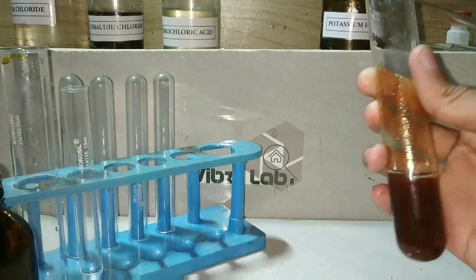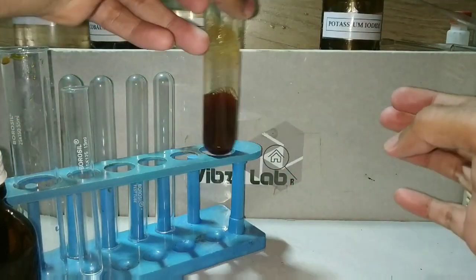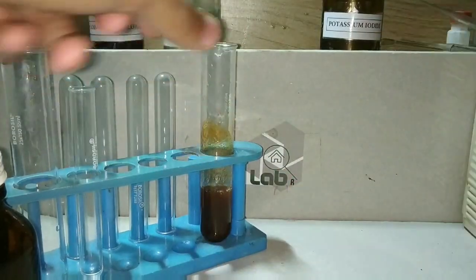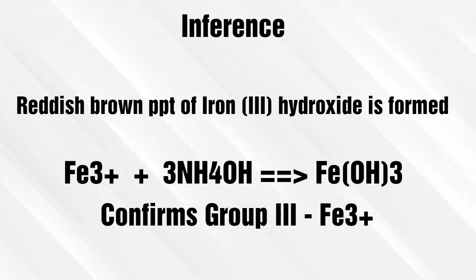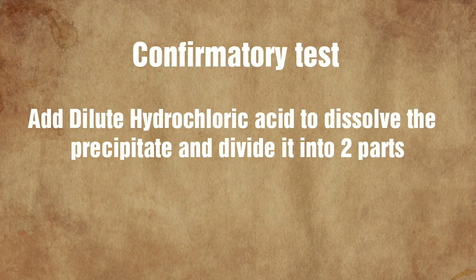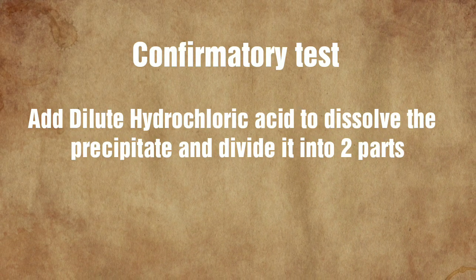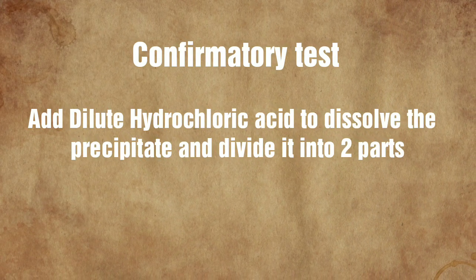All the ammonia has reacted with the salt. The reddish brown precipitate is iron 3 hydroxide. Any precipitate formed on adding ammonium hydroxide confirms the presence of group 3. The reddish brown color points towards ferric ions. Now we will dissolve this precipitate in dilute hydrochloric acid and divide the solution into two parts.